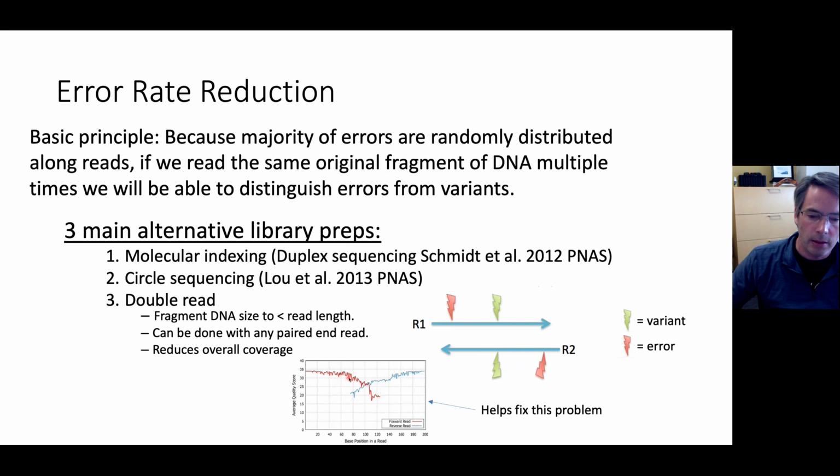So in this overlapping read preparation, all of these low quality things on the end are going to be eliminated because they're going to be unique to either read 1 or read 2. Okay, and it's only the ones in that region that show up in both reads that you're going to say those are the actual variant.